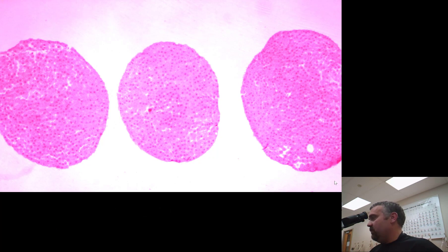I'm a huge fan of creating your own slides. When I was a kid, I created slides of pond water and spit and insect parts and anything I could find, but I definitely recommend if you purchase a handful of slides that one of them be a mitosis slide, which you can do things with onion tips and the like, but this is actually a fish blastodisc mitosis slide.